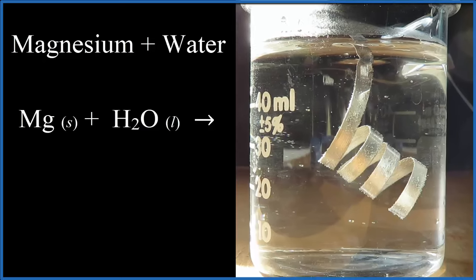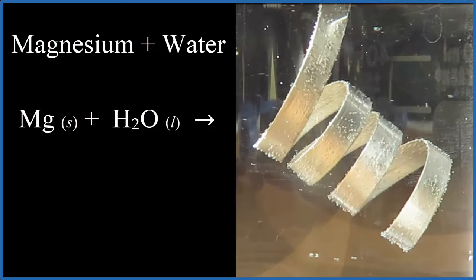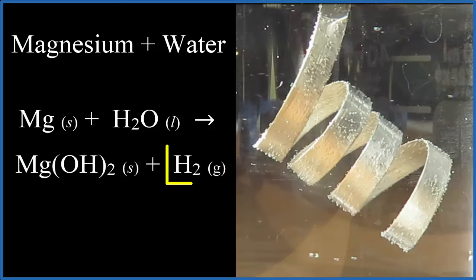So now we can see those bubbles forming. That's a gas. In fact, if we collected that gas and we put a flame near it, it would combust. If we had enough, it would make a nice little explosion. That's hydrogen gas, H2.